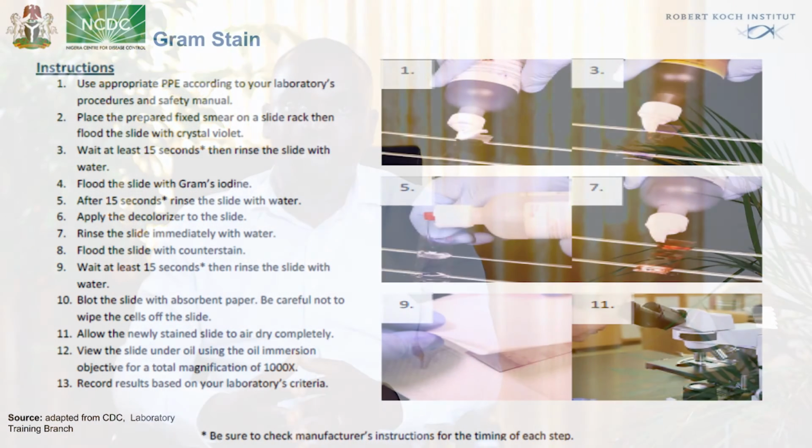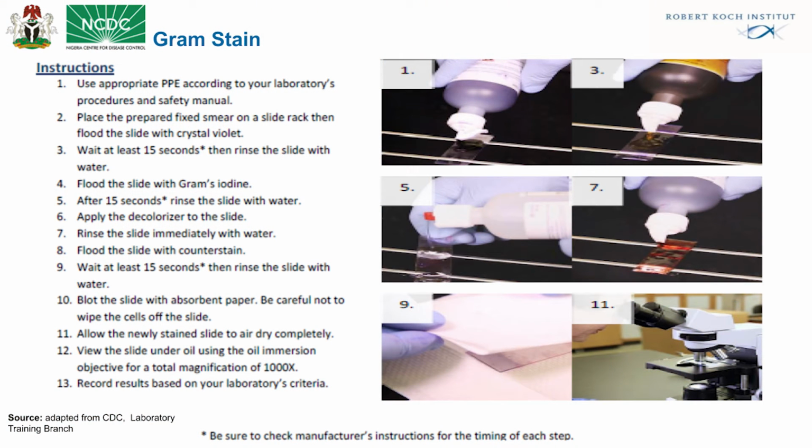The gram staining procedure begins by making the smear from the blood culture bottles during subculture, and this is fixed by flaming on the Bunsen flame. After that, the slides are placed on the staining rack and flooded with the primary stain, which is crystal violet, for about 1 minute. After that, it's rinsed and flooded with the Lugol's iodine for 1 minute or so. This is then rinsed, and then the decolorization process follows. It is pertinent to know that at this stage, the timing is drastically reduced to prevent over decolorization.